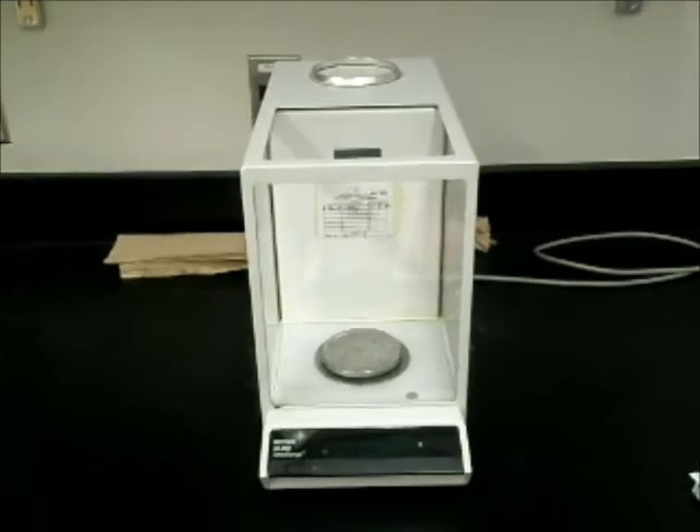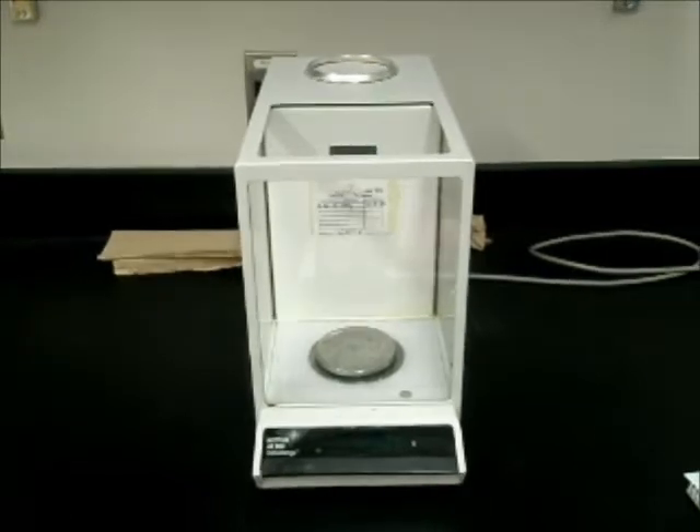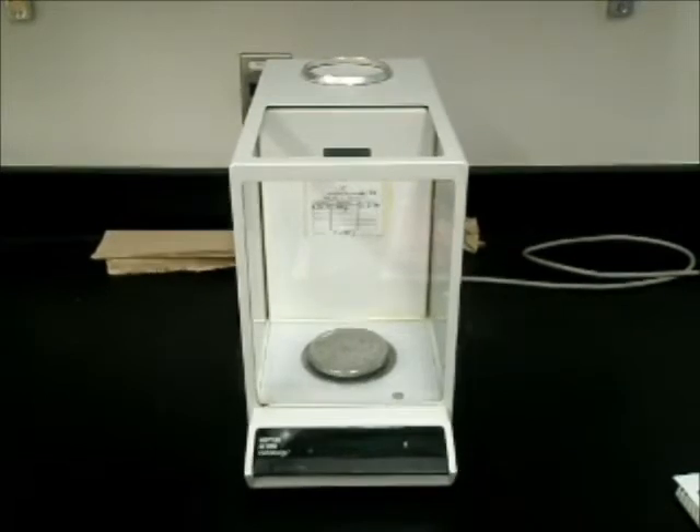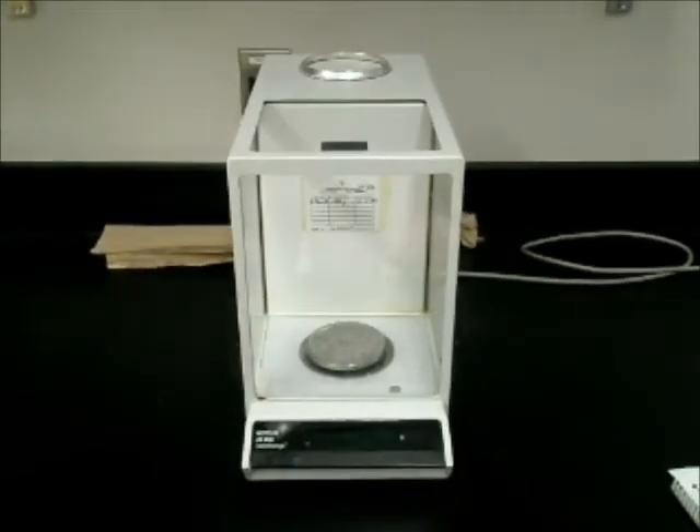When using an analytical balance, there is some uncertainty behind the measurement. Each balance has a small amount of error. However, one can prevent this from altering the results by using the same balance throughout the duration of the experiment.